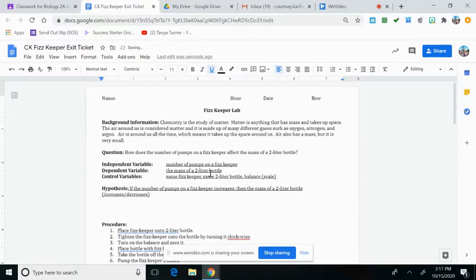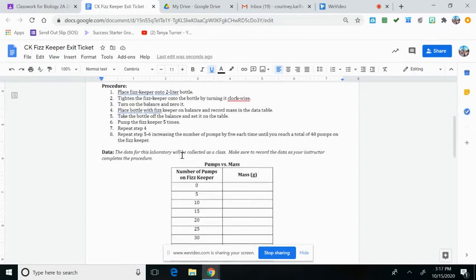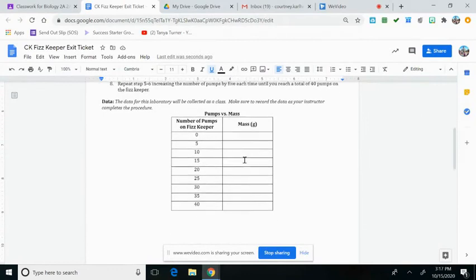I just wanted to see if I could get it all on the same page, but I cannot. All right, then here's the procedure that Mr. Guyette is going to go through. So your job, you should pause this video.